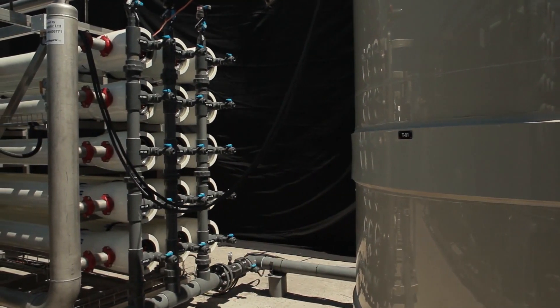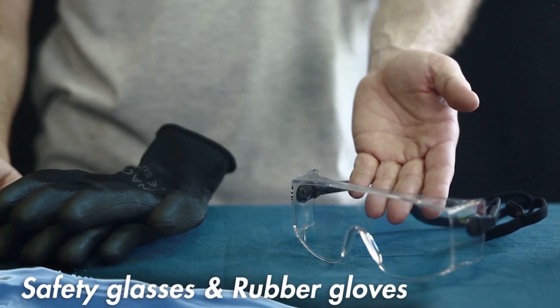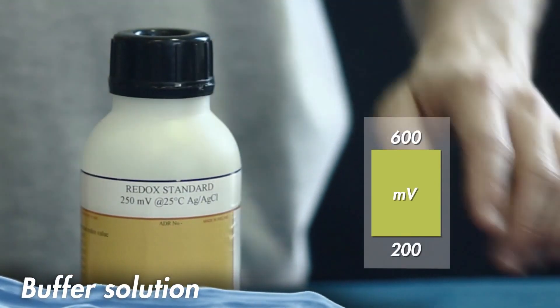During this procedure, you must wear required personal protective equipment. We recommend safety glasses and rubber gloves. You may use any buffer solution between 200 and 600 millivolts.